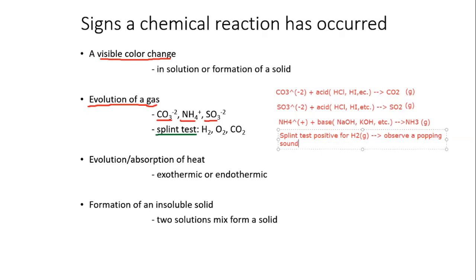So if you move the splint near your test tube where the gas is being produced, and you hear a popping sound, that would indicate the presence of H2. To give you a quick example, if we react magnesium solid with HCl, we produce magnesium chloride and H2.